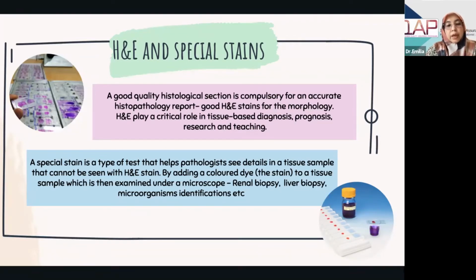And the special stain, as we all know, can help us to see the details of the tissue sample that cannot be seen by H&E, and it is widely used in special cases like renal biopsy, liver biopsy, or in identification of microorganisms.